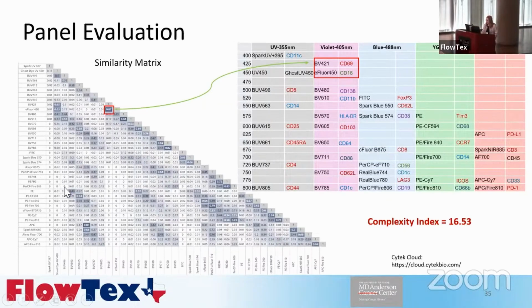I'm going to pull up the similarity matrix. This I've shown you before. I don't know exactly how the math works, but it's a measurement of how similar any two dyes are.